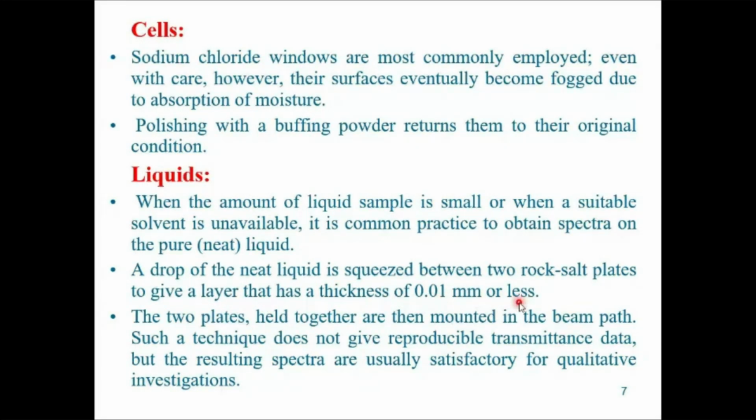When the two plates are held together and mounted in the beam path, such a technique does not give reproducible transmittance data because it is very difficult to get a uniform layer throughout. But the resulting spectra are usually satisfactory and qualitative investigations can be done.